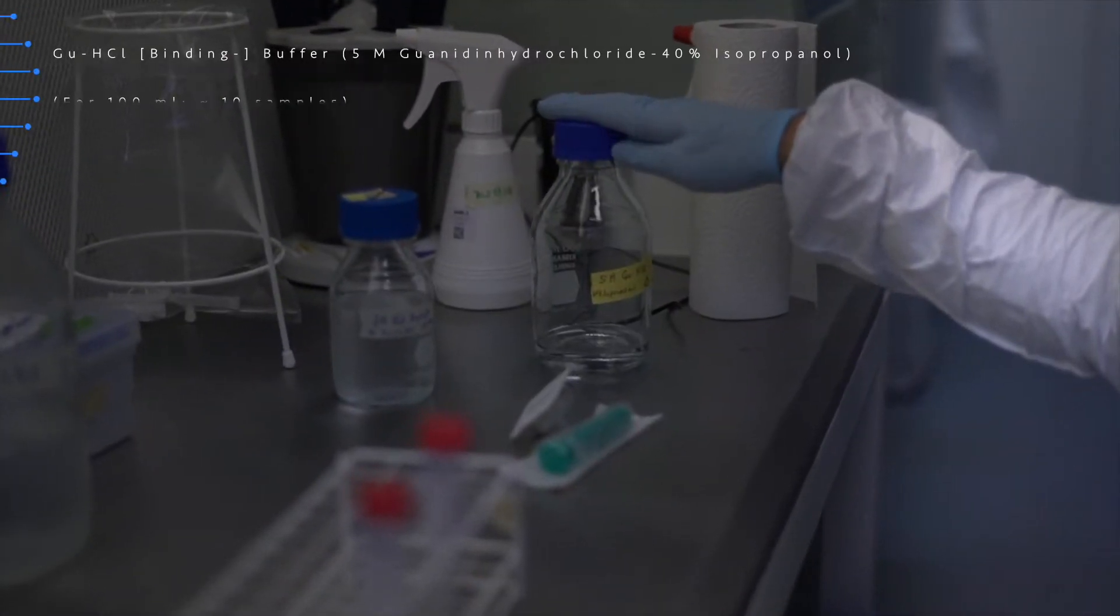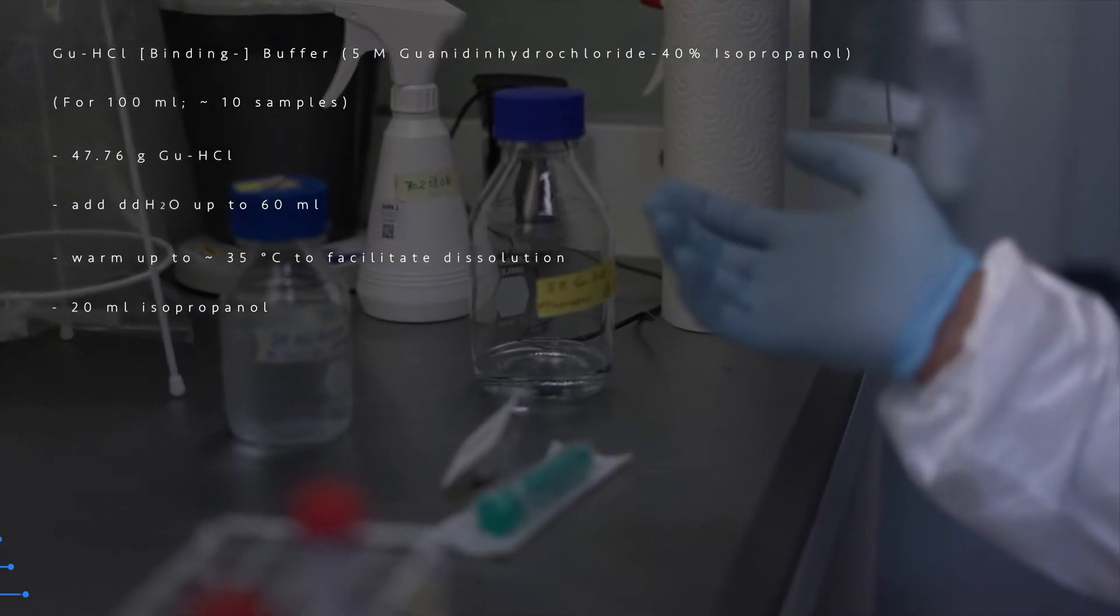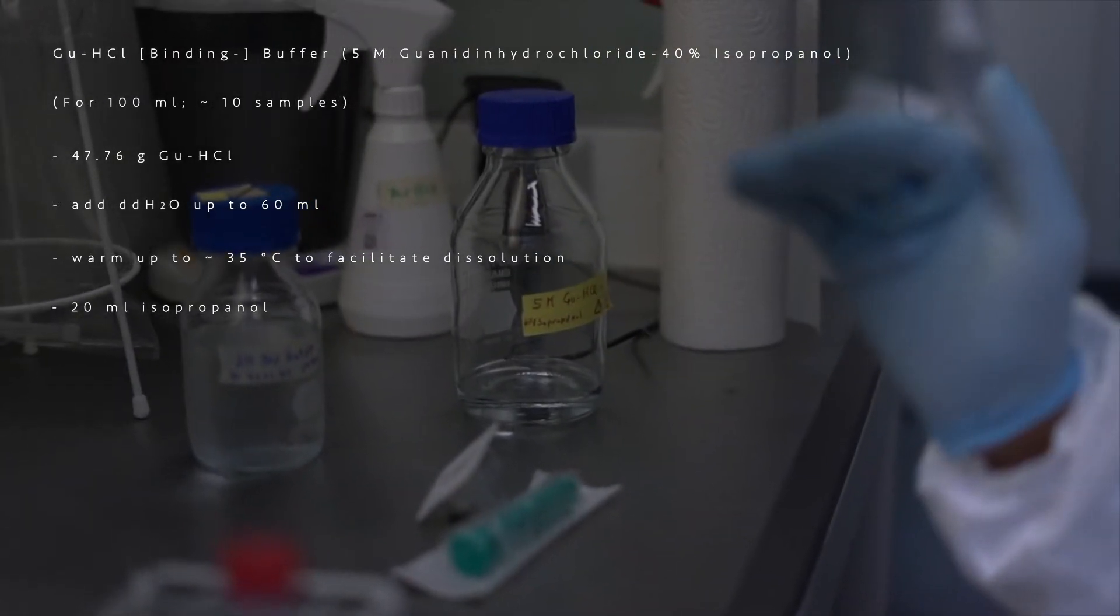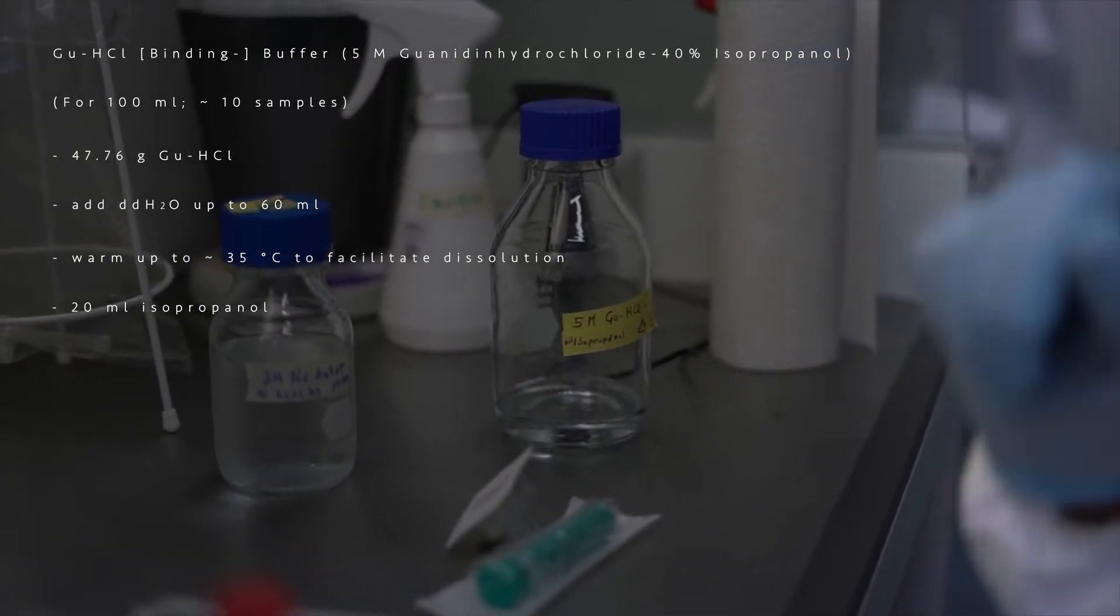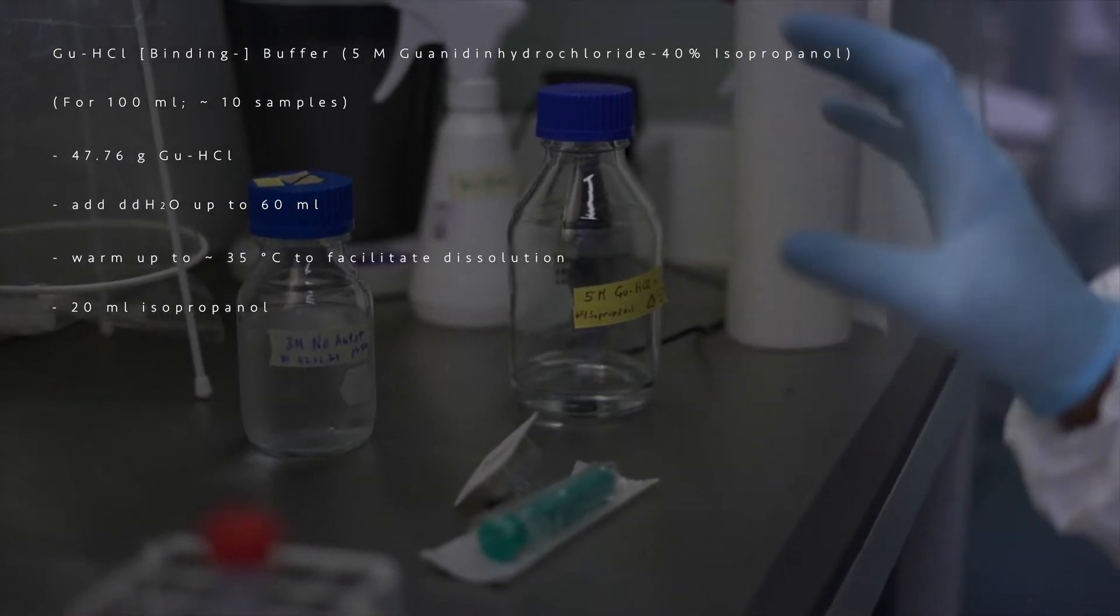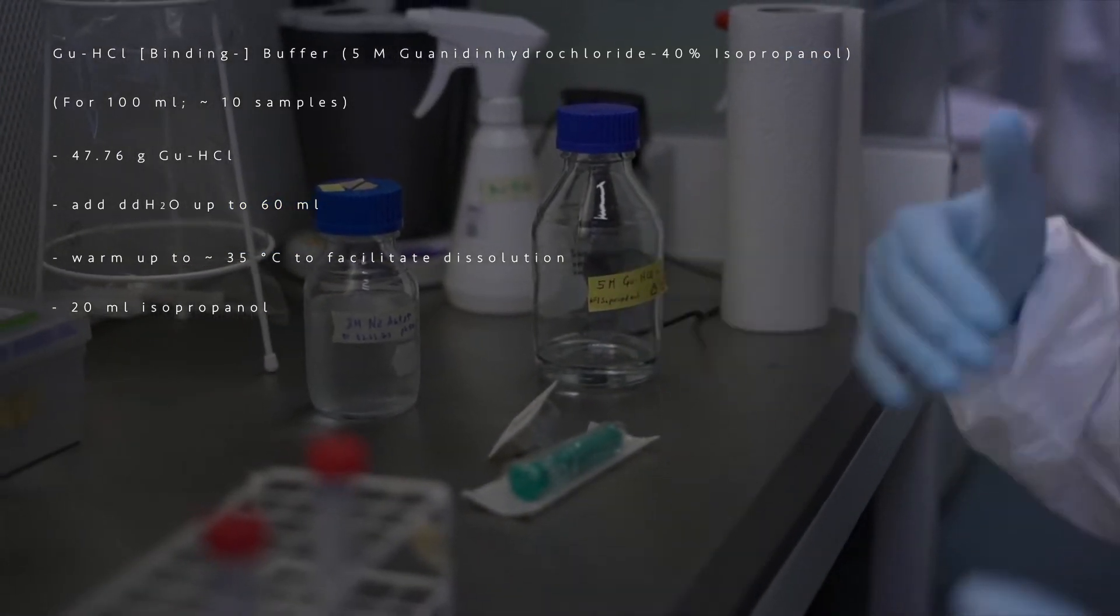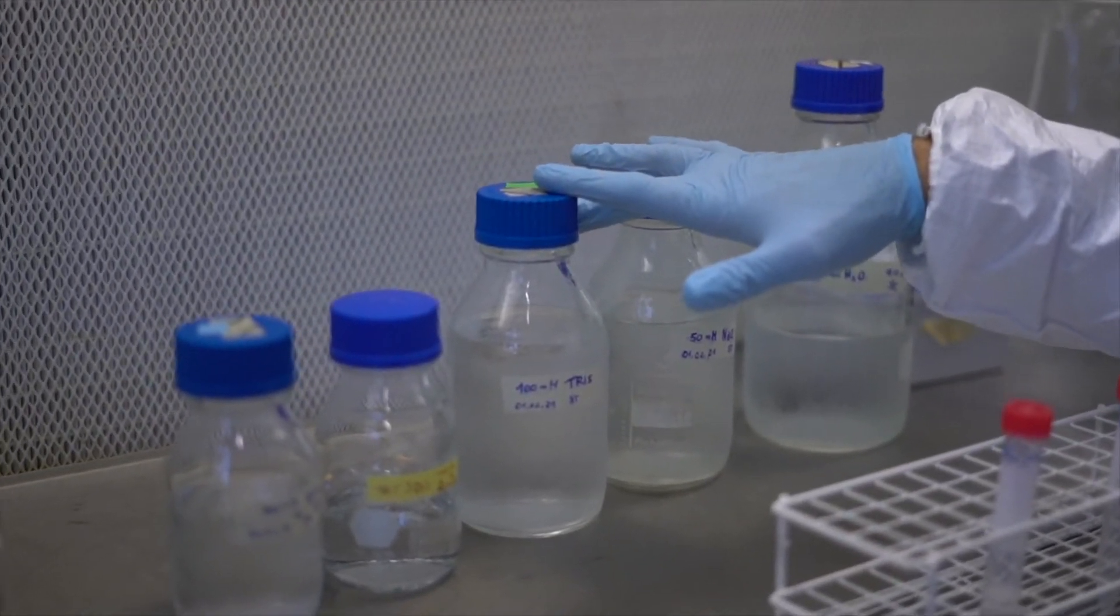The guanidine hydrochloride buffer 40% isopropanol is basically the binding buffer. It's not much different from those binding buffers that we find in commercial kits for DNA isolation. Those silica column based DNA isolation kits, we need to prepare on our own because we need big amounts. Today this evening we are going to prepare the PTB-DTT buffer.